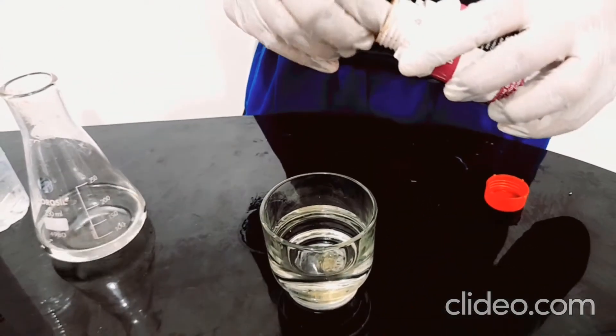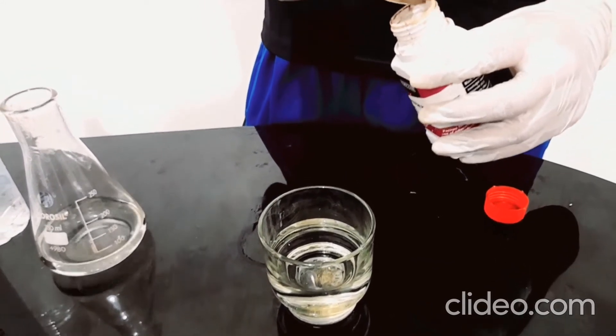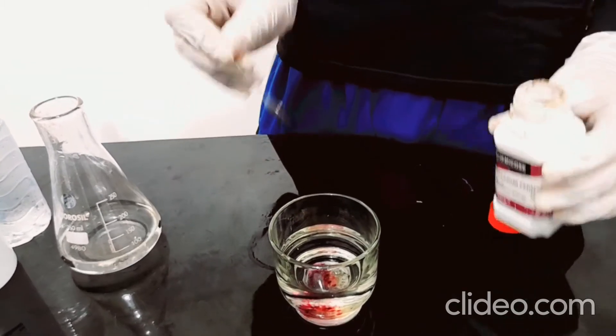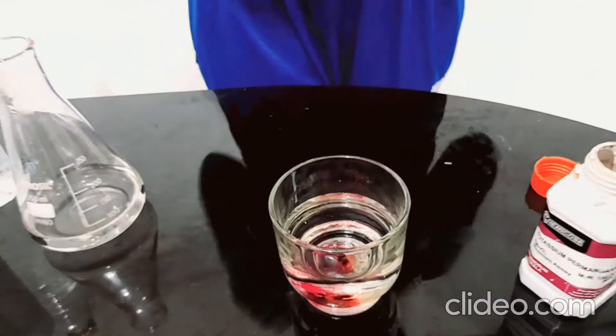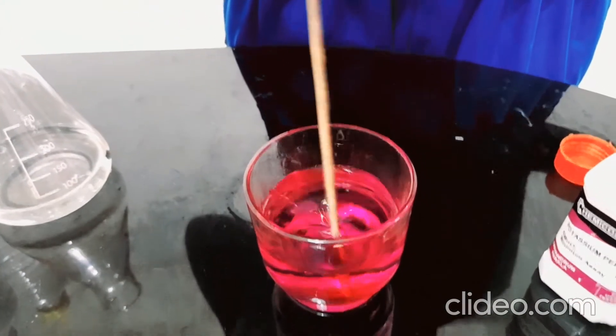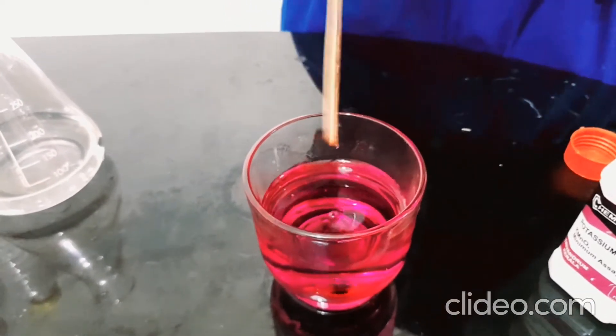So the potassium permanganate — you should only add a bit. I tried this a few days ago and it always spoiled because I added a bit more. Just this smidge of the powder is enough. Let's use a stick to just stir it up. Yes, it's perfect — just look at it, it's perfect.